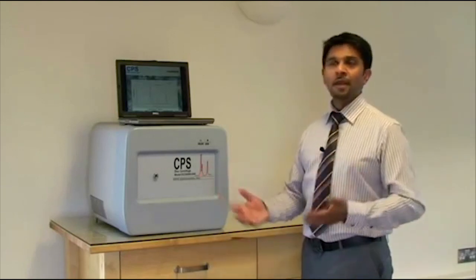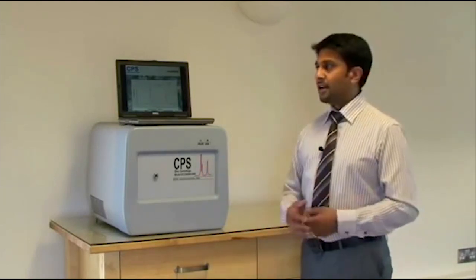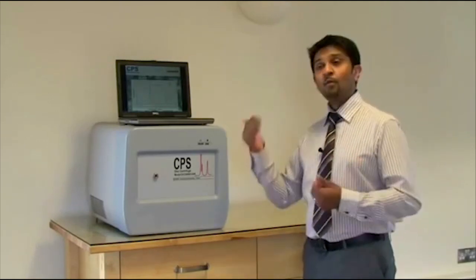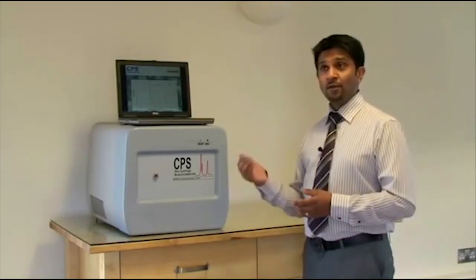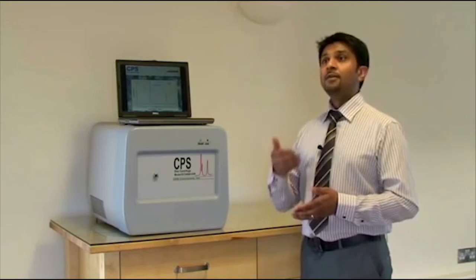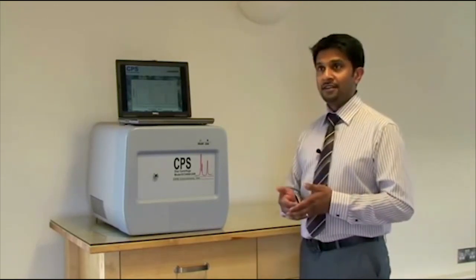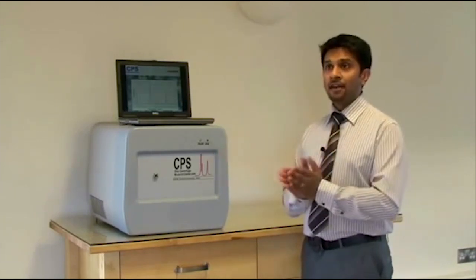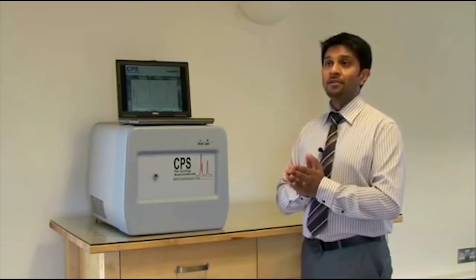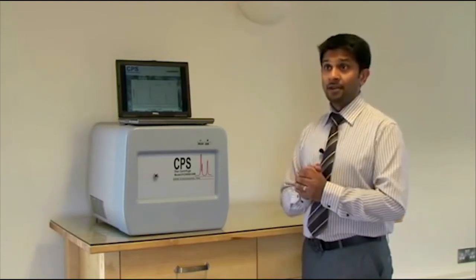Each time the instrument is used it may be used at a different disk speed, may have a different gradient, different user. Why do we get the same results? The reason for this is because before we run a sample we always calibrate the instrument, meaning we run a sample of known size and known density and we are able to use this to convert the time axis to particle size for the material that you're examining.